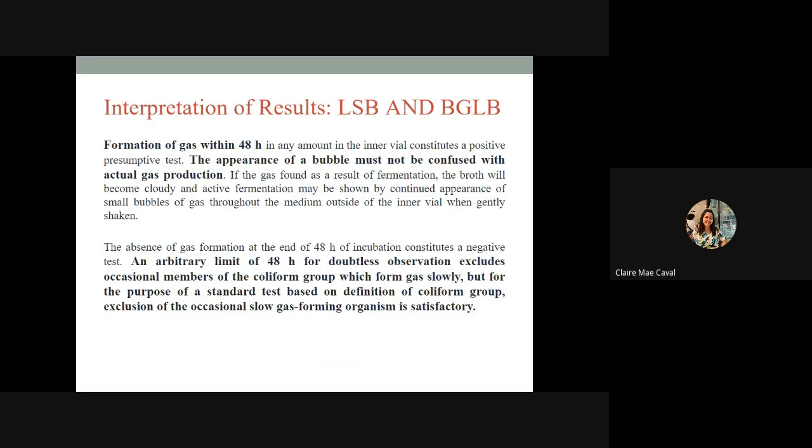The appearance of a bubble, this is what I mentioned in my previous pre-recorded lecture. I guess that is in the culture media preparation. If there is an appearance of bubble during the preparation of culture media, it should be discarded so that it must not be confused with actual gas production. Okay? So I will not discuss this anymore. This is what I mentioned as well, an arbitrary limit of 48 hours for total coliform, even in LSB, the presumptive test, is given to give chances for slow gas forming organisms as well as for late lactose fermenters.